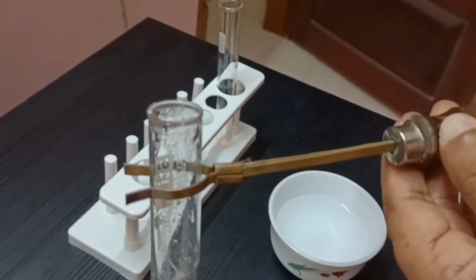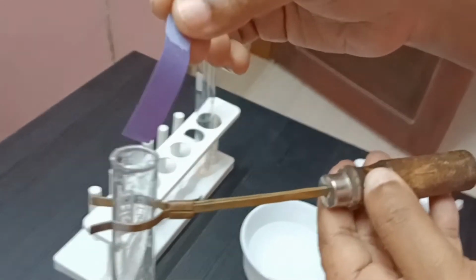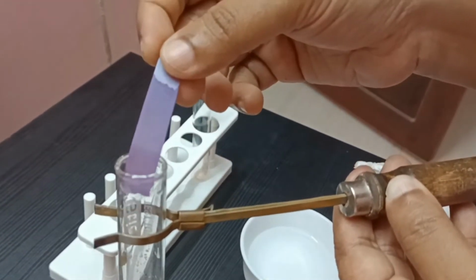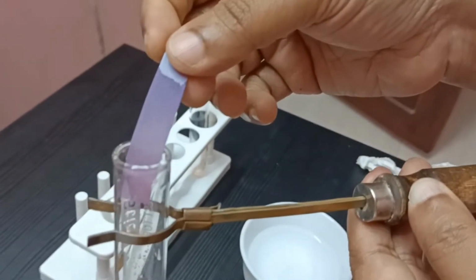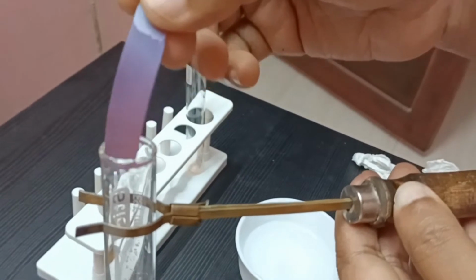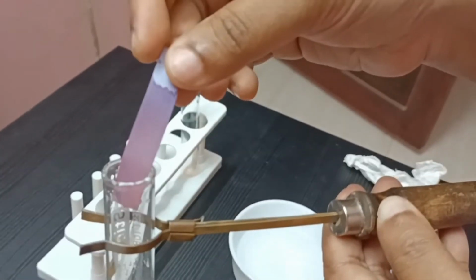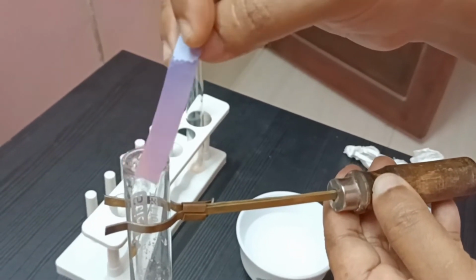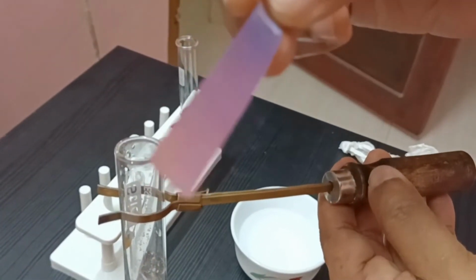So, in order to test acidic nature, we can take litmus paper as an indicator. I am going to bring a moistened blue litmus paper to the mouth of the test tube and watch the color changes. We can see the color of the blue litmus paper changes to red, slowly changing to red color.